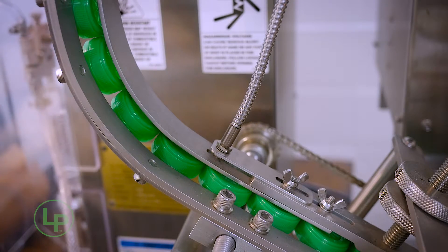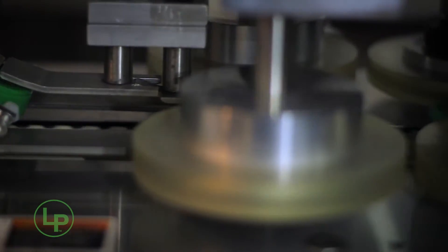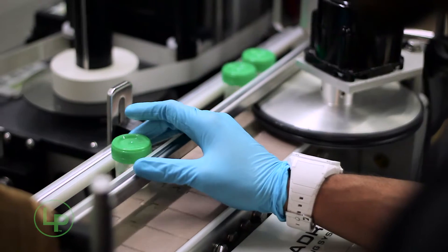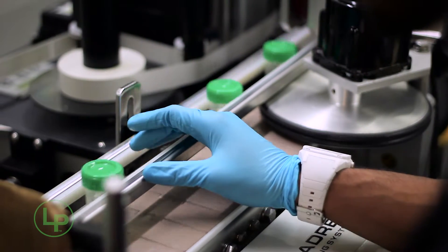LGM International plans to increase the current line to 20 million vials yearly while maintaining production and process quality.